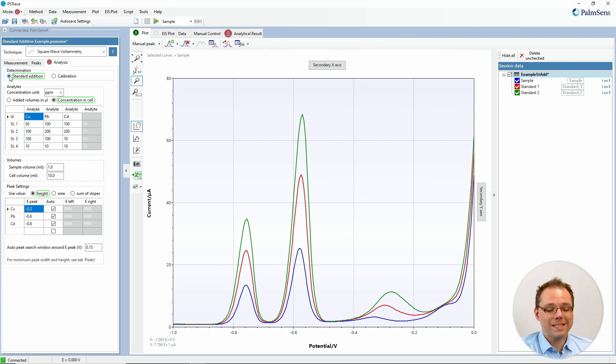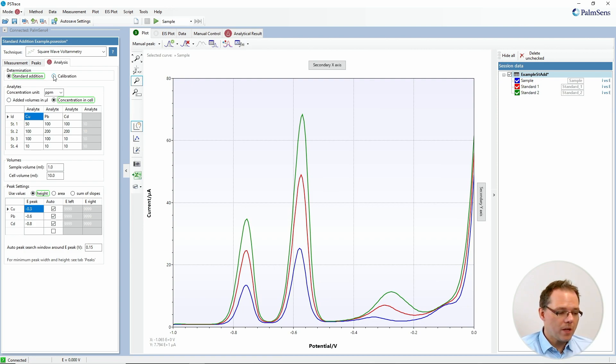First you choose whether you want to perform a standard addition or use a calibration curve. A calibration curve means that you make measurements with standard solutions where you know exactly the concentrations, and you plot the signal you get versus the concentrations. Then you use this curve to do the reverse: to calculate from signals you get from unknown solutions the concentrations of those solutions. That is the calibration approach.